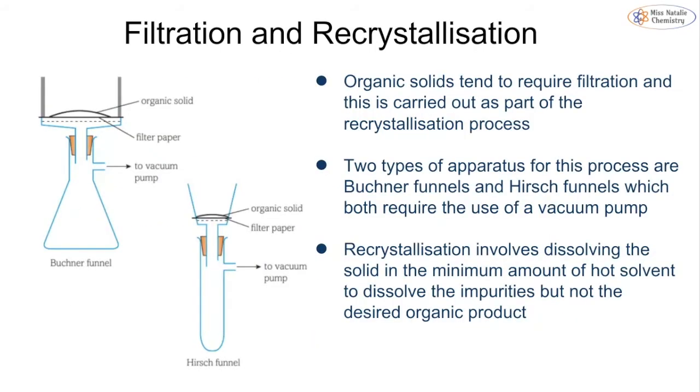Sometimes what we might also do is undergo a process called recrystallization, and they love to ask about recrystallization in an exam. It goes hand in hand with a process called filtration as well. And we use potentially two different types of funnel that you may not have seen before, called a Buchner funnel or a Hirsch funnel.